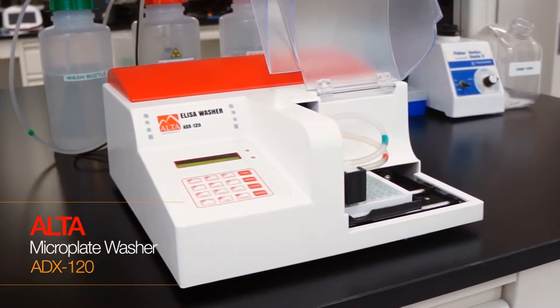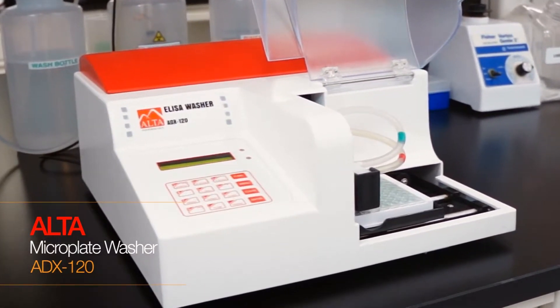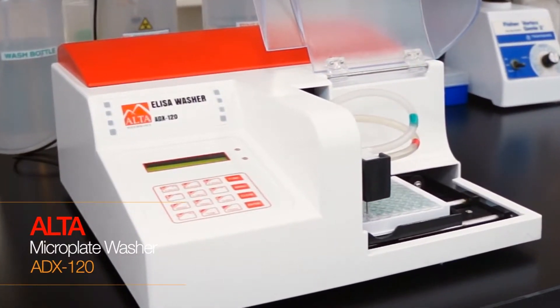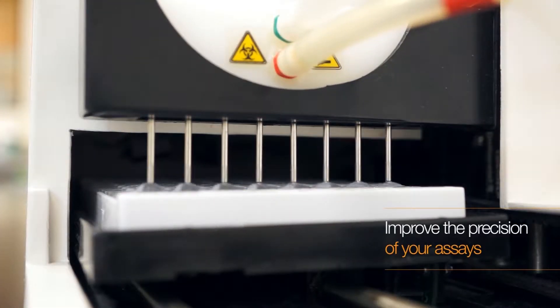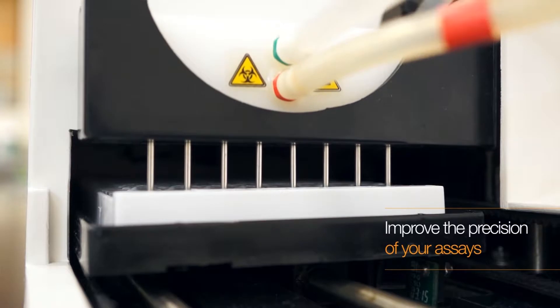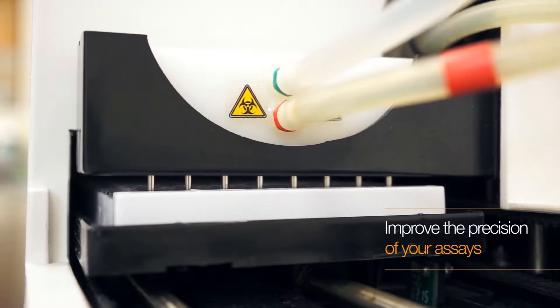CTK's user-friendly Alta Microplate Washer offers reliable and efficient washing at a very affordable price. The Alta Microplate Washer will improve the precision of your assays by eliminating any errors that can happen during a manual wash.